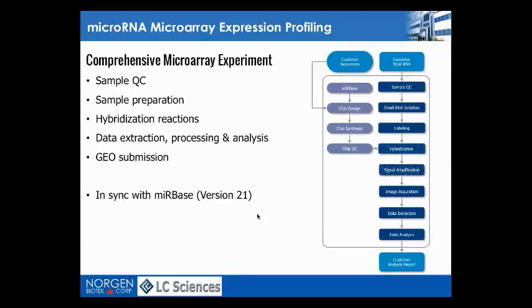And a big advantage, especially when you work with species that are less well characterized, is that you don't need any prior sequence knowledge. That's basically the limitation for the microarrays. You need to know the sequences so that you can put the corresponding probes on the chip.